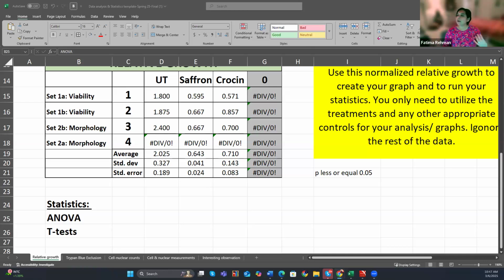What it will give you is that information. It will tell you that in all these 5 groups or 100 groups or the various samples that you've given me, somebody is different than the others. One somebody or multiple somebodies, right? One or more samples are different, but it will not tell you where that is.